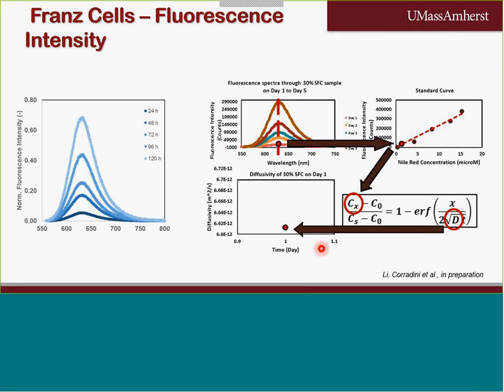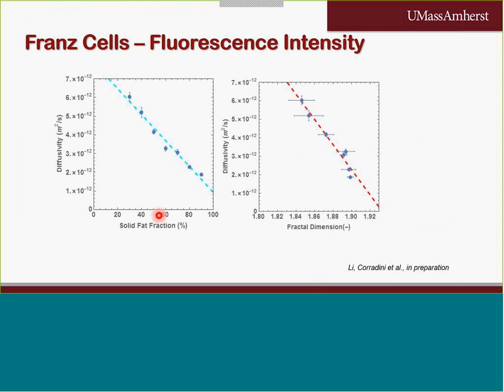This allows us to correlate diffusivity with solid fat fraction and also with fractal dimension. And that has important implications in terms of development of appropriate fat mixtures in order to reduce fat blooming and fat migration, which is normally not desirable in many chocolate candies.